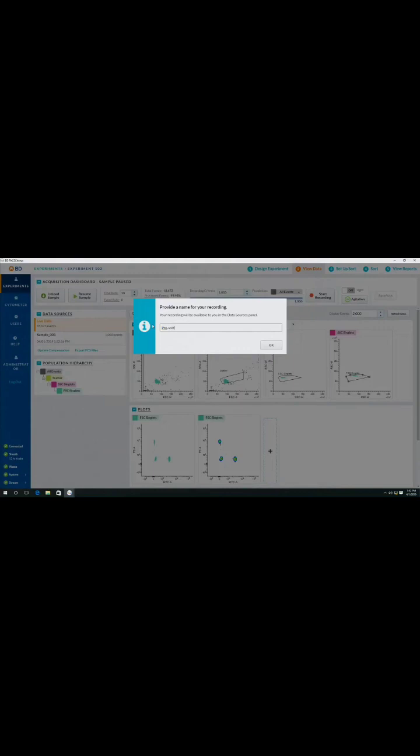The BD FACS Melody comes with pre-calculated compensation for up to 11 different fluorochromes, and you can also run your own compensation control. Once the settings have been set, we can start recording some samples. I'm going to record 1000 events. I'm going to label this sample pre-sort.